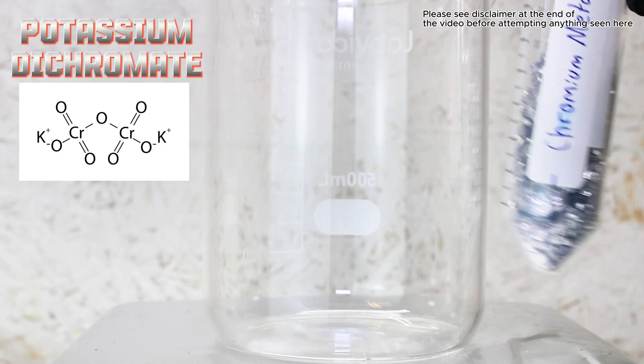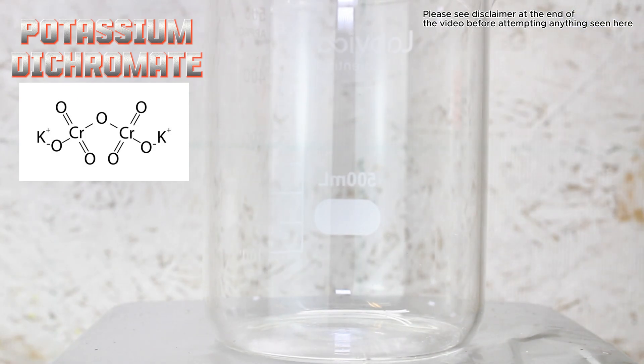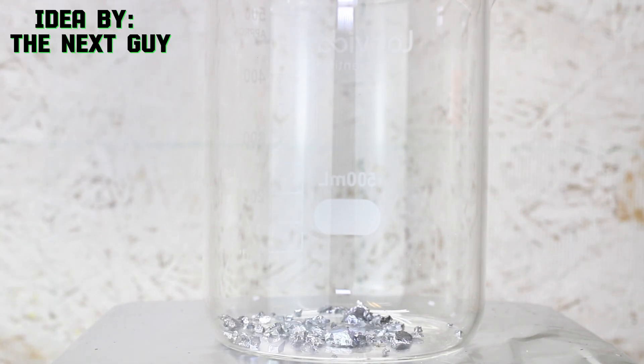Today I'm going to make the chemical potassium dichromate from elemental chromium. This video was actually a request from my patron, the next guy, and I think it turned out pretty well.